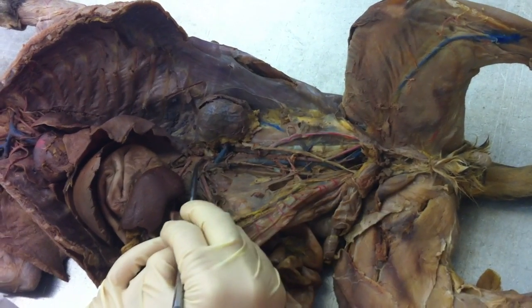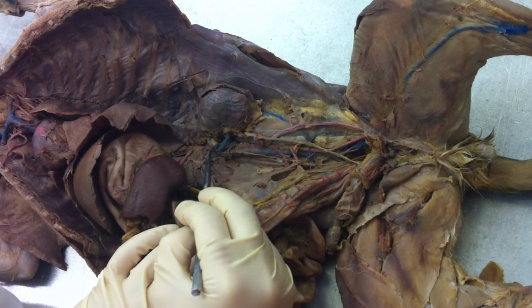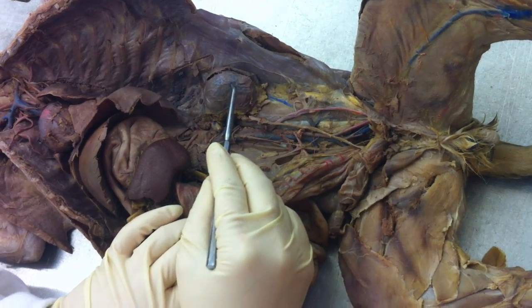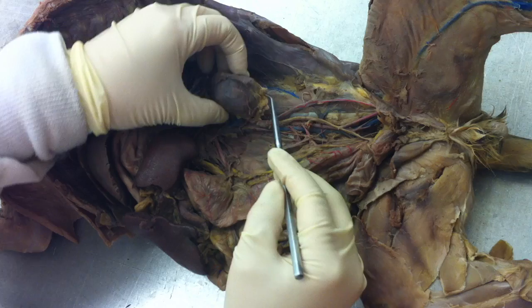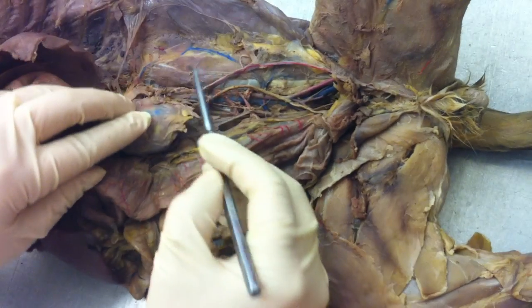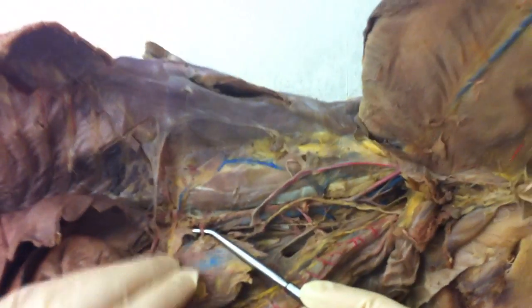Okay. So let's go back up here and continue our trip down the dorsal aorta or descending aorta. Our next stop is the blood vessels that serve the kidneys. Those should be the renal. And sometimes they're hard to find because they're buried underneath the veins. So if you want to find them, sometimes you have to flip them over and find them that way. Okay?